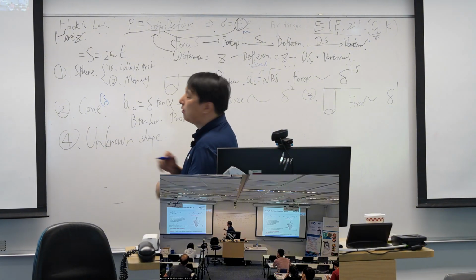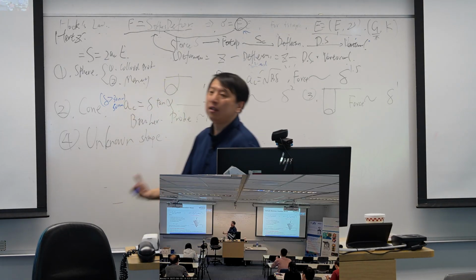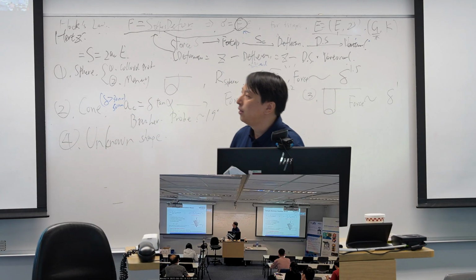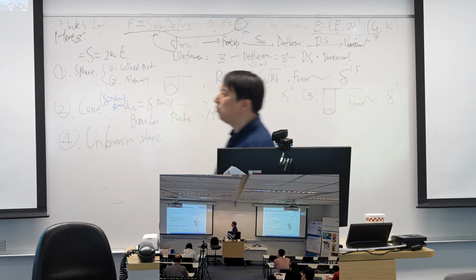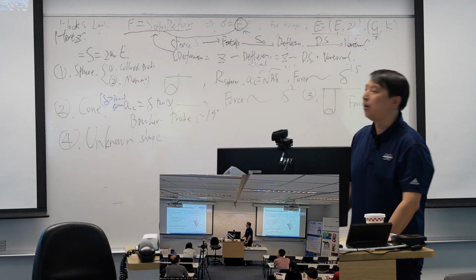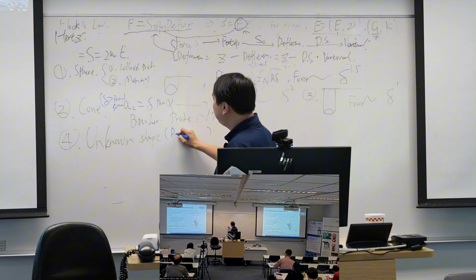Usually in the references, when it's over 30 or 50 nanometers, they think it's large enough. But if your deformation is so small, you cannot treat this as a penetration, so you cannot use that model directly. For this one, we need to do some calibration. That's the so-called relative method.